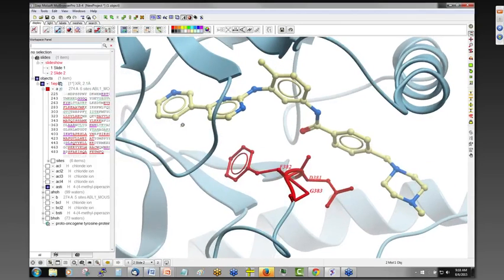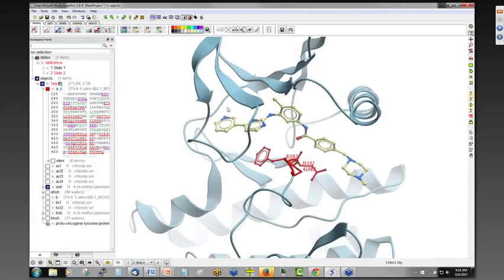Just to show you some other coloring, which is sometimes useful. So the ligand, we might not be happy with this yellowish color for the carbons. We can change the coloring of the carbons. So we need to select the ligand again. And then you can see that these buttons show you what representation this ligand is in. It's not in wire, it's in stick, it's colored blue.